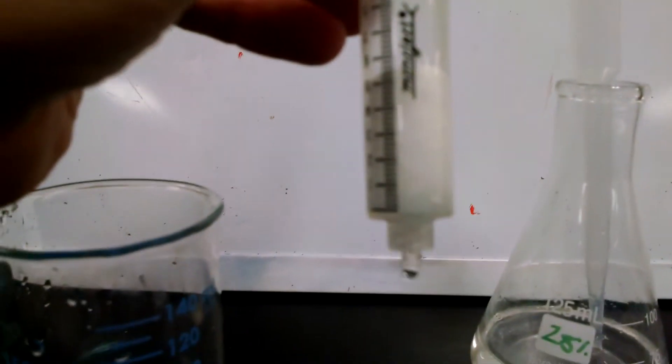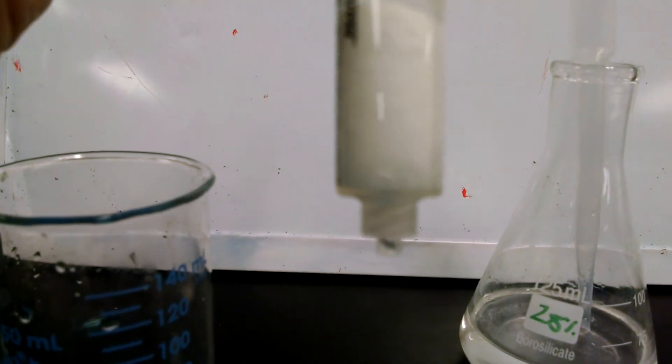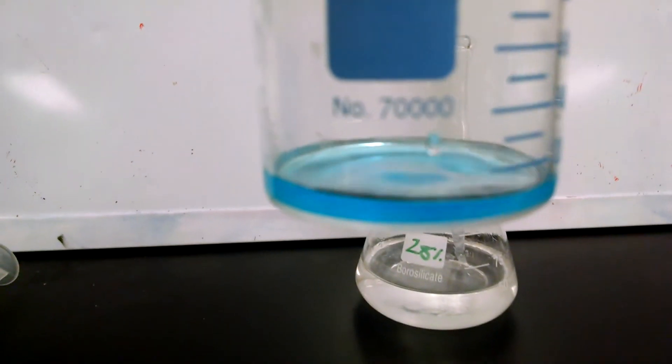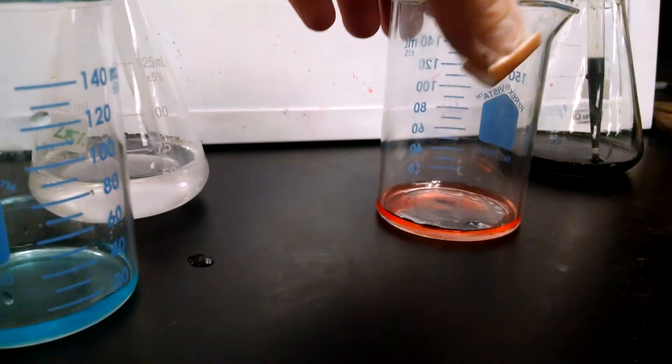We see the final result. Our column now is clear, meaning that both the red and the blue has been taken off. And let's see what we've got. I've got a beaker of blue and I have a beaker of red.